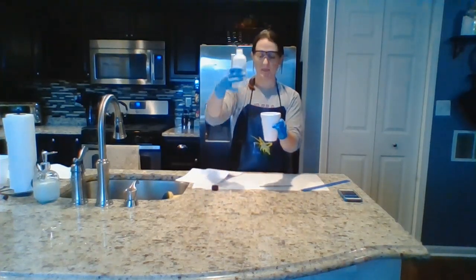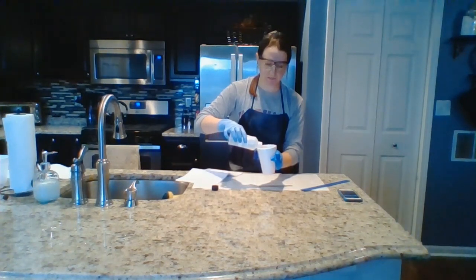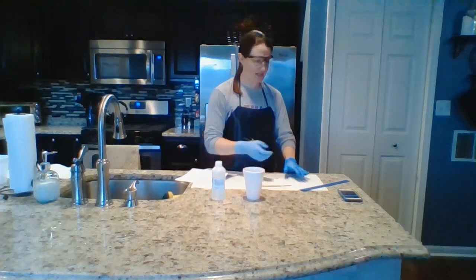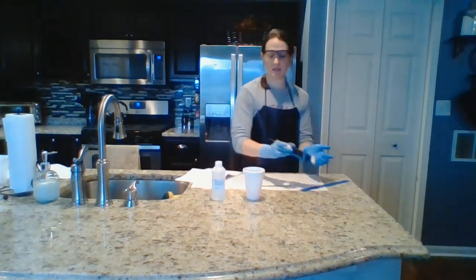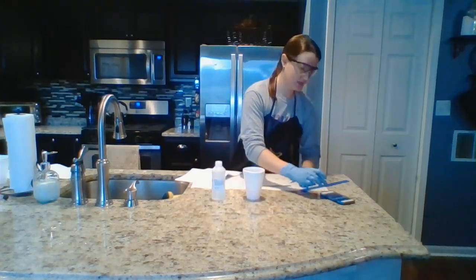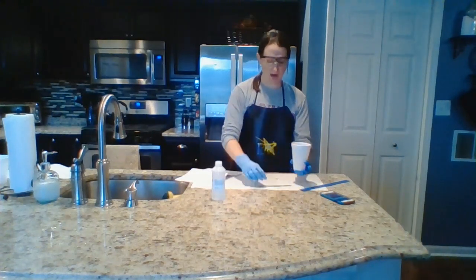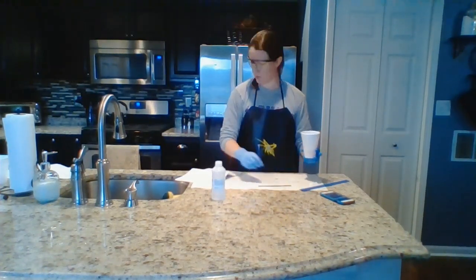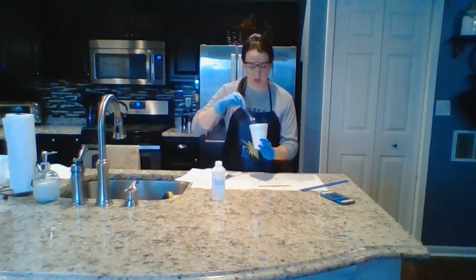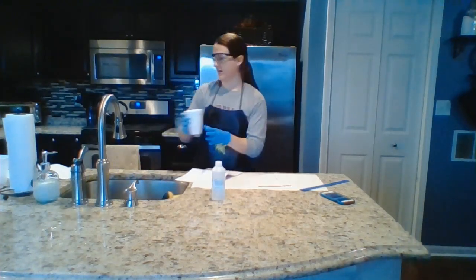Next, I'm going to take my vinegar and cover my cubes with vinegar in the cup. As soon as I do that, I need to set a timer for 5 minutes for these cubes to sit in the vinegar, so I'm just using my phone. So let's get that started and let it sit for 5 minutes. You might want to use the spoon again to gently stir the vinegar. Make sure it's covering all parts of the agar cube over the next 5 minutes. Otherwise, you can set that aside.